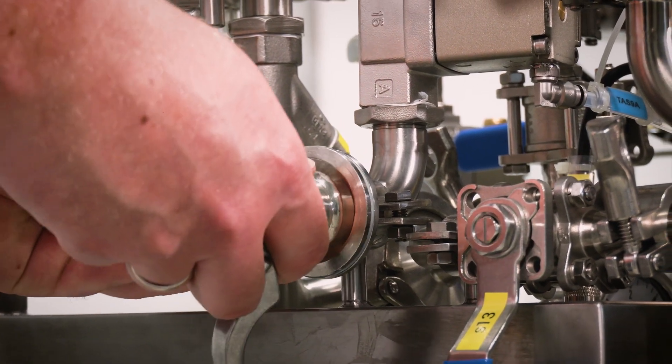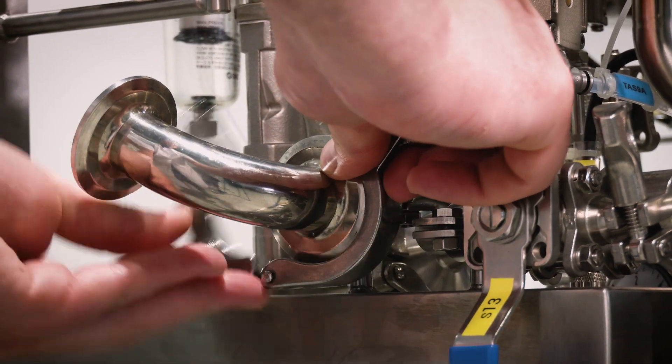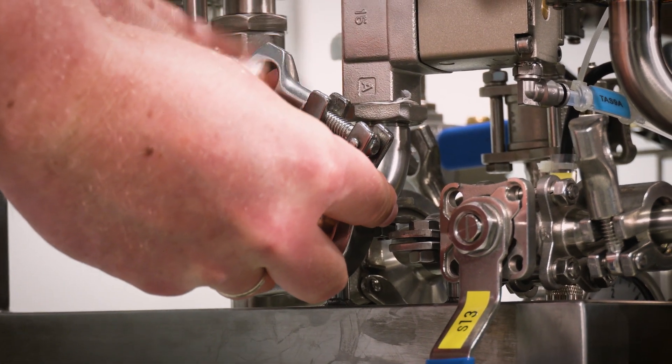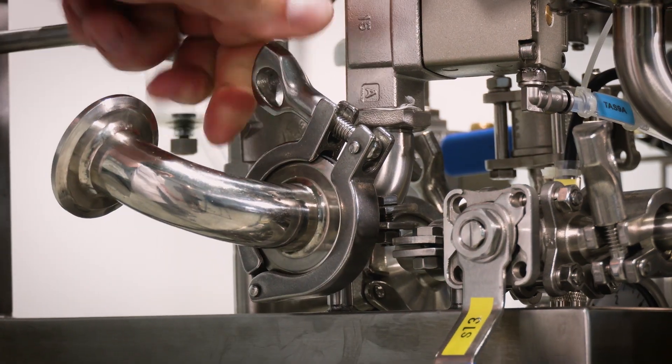Step 7. Connect the exhaust gas outlet to the bioreactor using the appropriate hoses and tri-clamp connections. Ensure a tight and reliable connection.